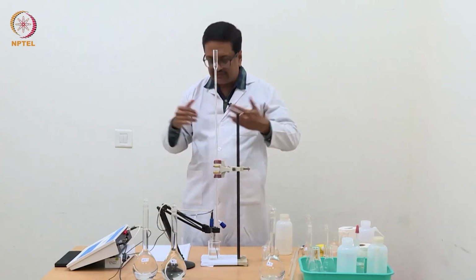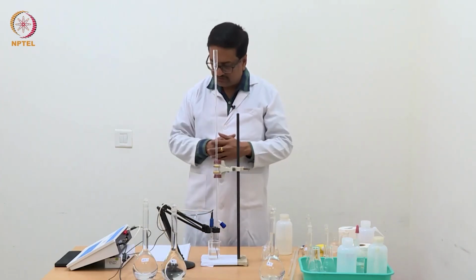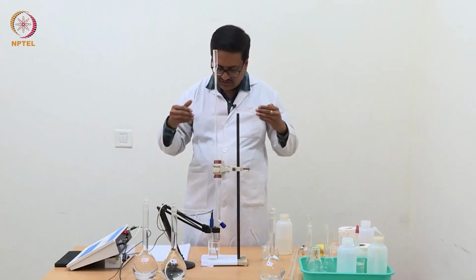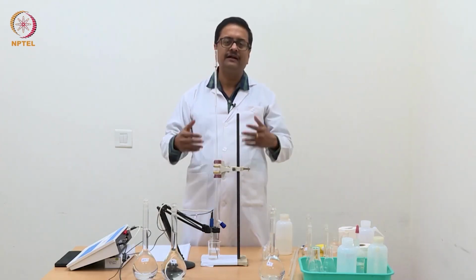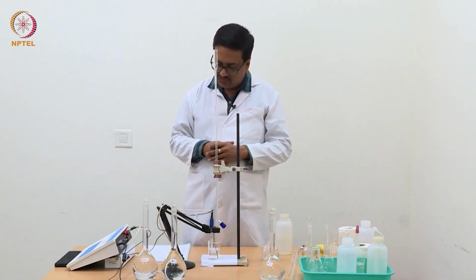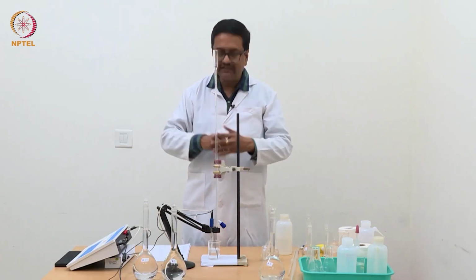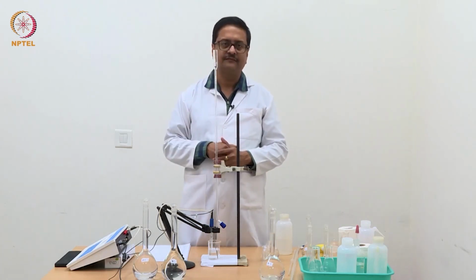So with this kind of data, one can stop the experiment and start plotting this data, and then as you have learnt in the theory class, we will have to plot delta pH versus volume of NaOH to find where the jump is maximum, and from that point we will determine the end point of this titration.